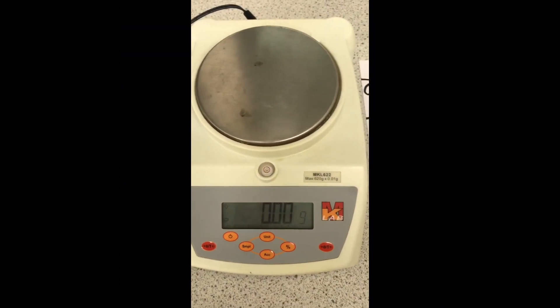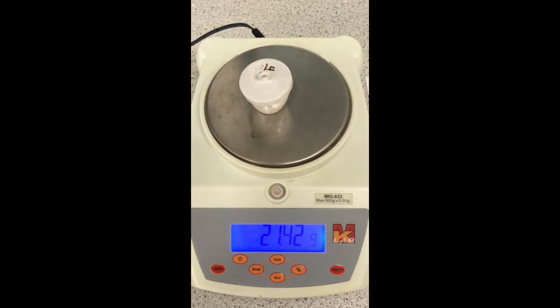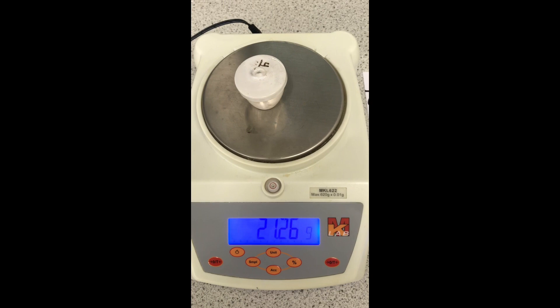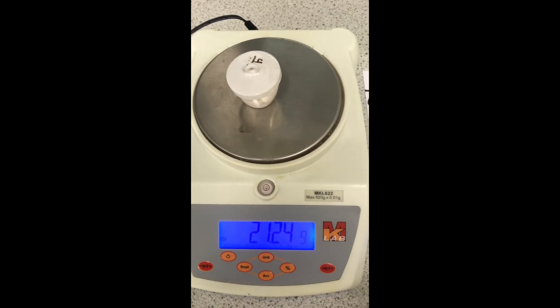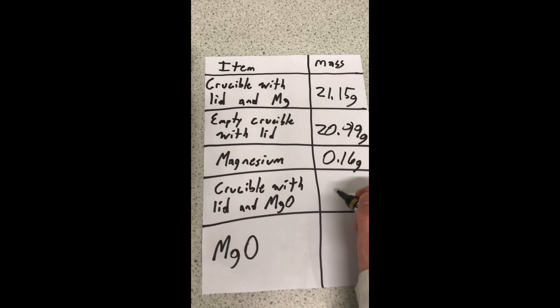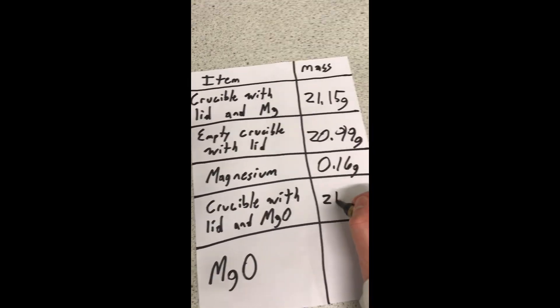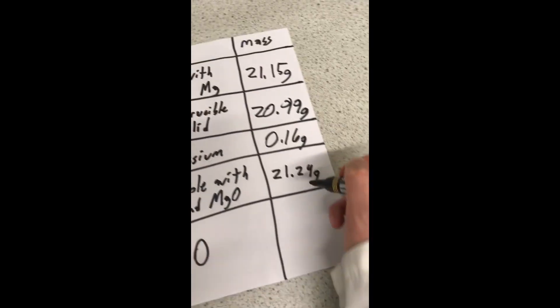My crucible is now cooled, so I will place my crucible with the magnesium oxide inside onto the weighing scale. We can see the mass is now 21.24 grams.